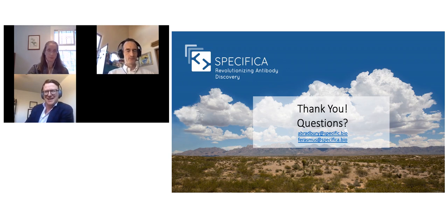And both in this case did not correlate very well. But the way this particular selection campaign was conducted does not necessarily mean it will relate to different selection campaigns, whereby you'll have much better correlation. There were certain factors that may not have been included in this particular scenario. It varies very differently, at least how we conduct it, from selection to selection, the conditions and everything else. And I'm sure that in other cases, you may find far better correlation. Not in this case, though.